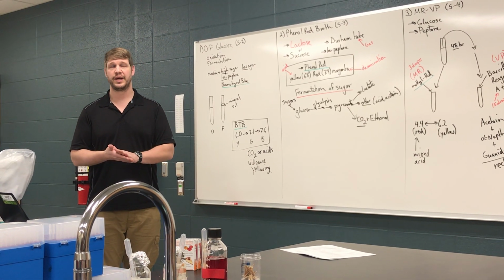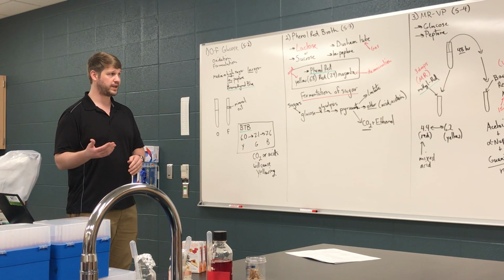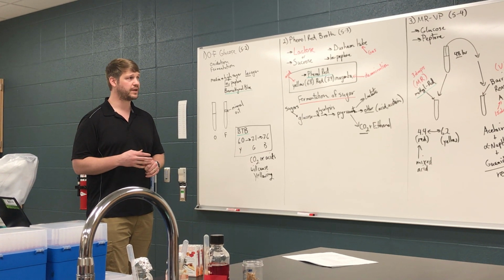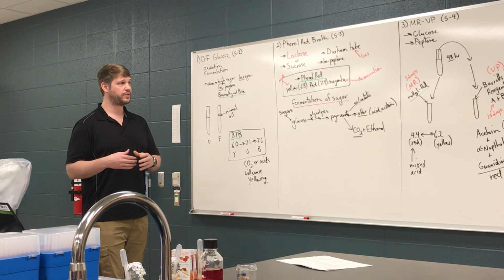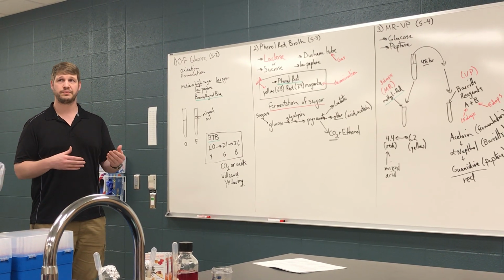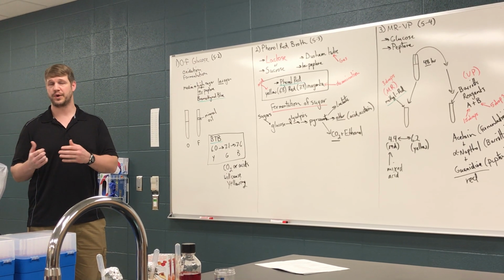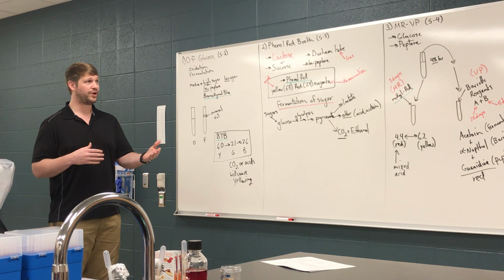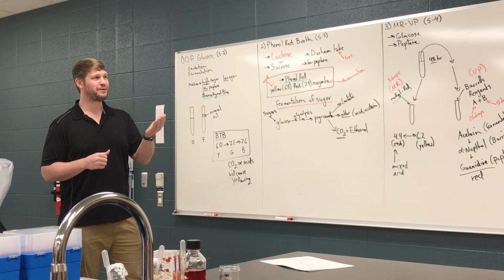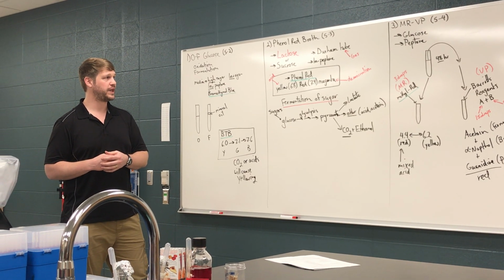It's very straightforward. Also, one other metabolic byproduct that is often detected by a pH indicator is ammonia. Often when microbes are utilizing amino acids as their primary energy base, they're going to produce ammonia, and that's going to alkalinize, or increase the pH, and so you can see that as well with the pH indicator.